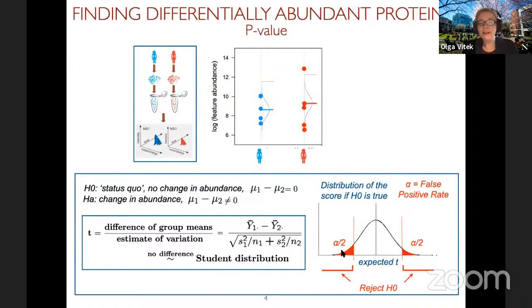So we say, okay, these values will have 5% probability of being observed in the situation when we have no regulation. So now what we will do, we'll calculate the actual signal-to-noise ratio from our data, and overlay it on this graph. So if the actual observed value is in the center of the distribution, we say, yeah, well, that's what we expect in this situation.